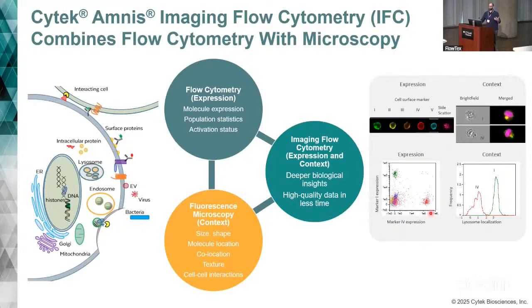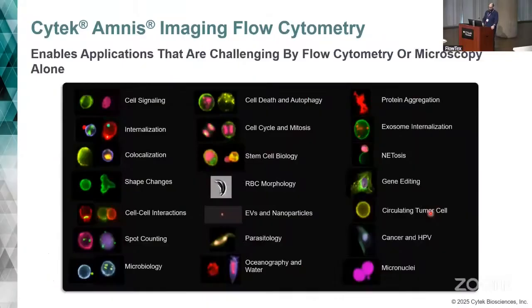That's really one of the true strengths of adding flow and imaging together: you're now able to do this immunophenotyping and understand that cells behave differently even if they're sitting within the same space. And they're doing different things, and you can do different functional assays to understand that.